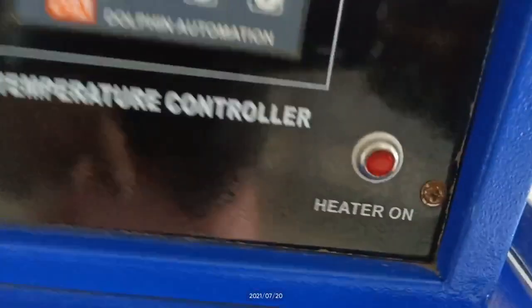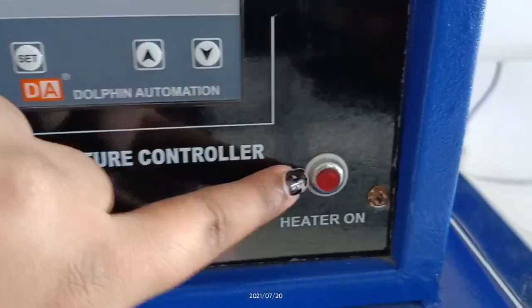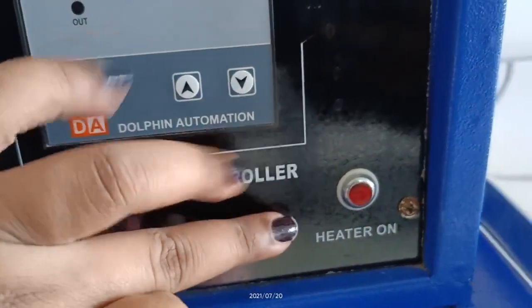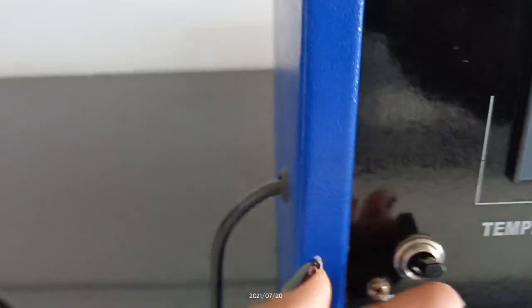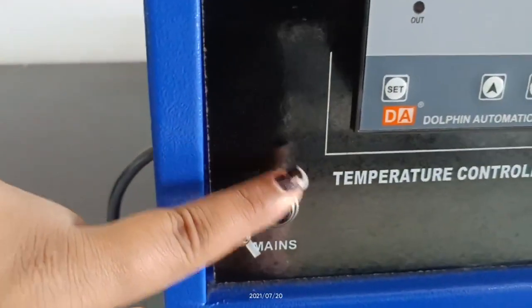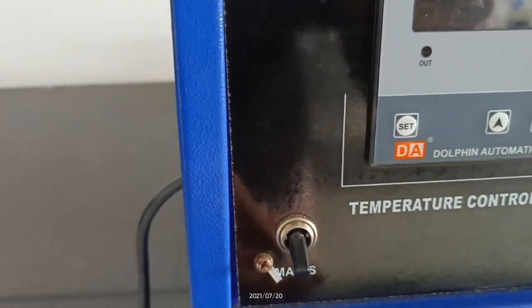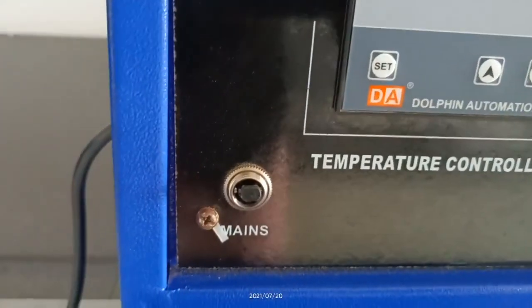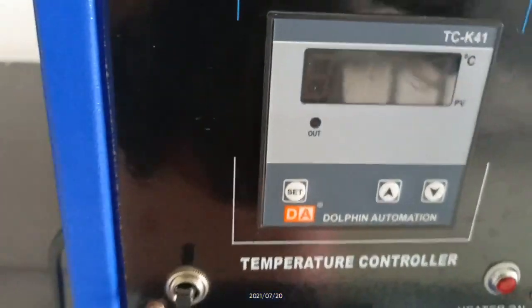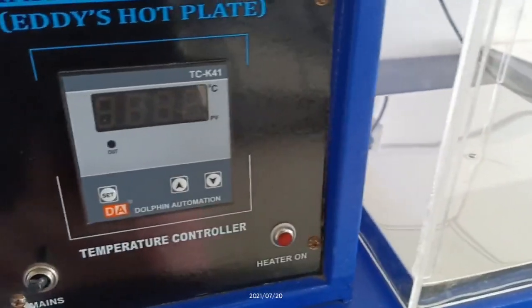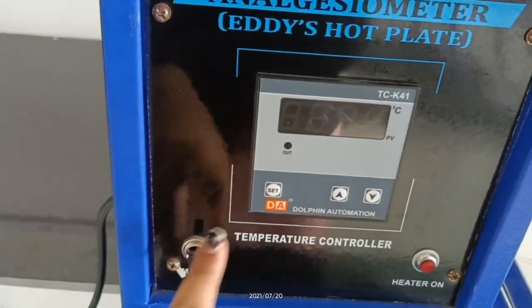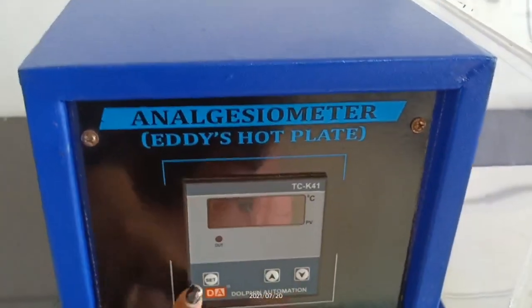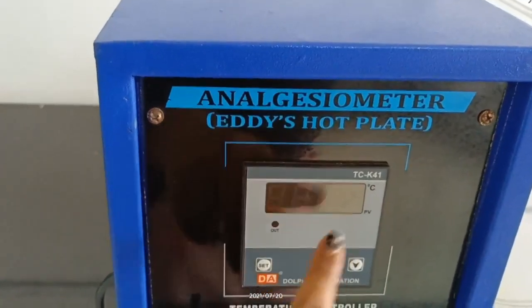The next part is the indicator — here you can see the red button, which is the indicator that shows whether the heater is on or off. Next is the power switch, which we use to turn the instrument on or off. The next part is the body of the hot plate apparatus — this black part which contains the on/off switch, indicators, and thermoregulators.